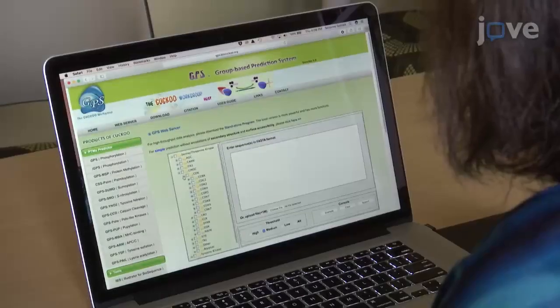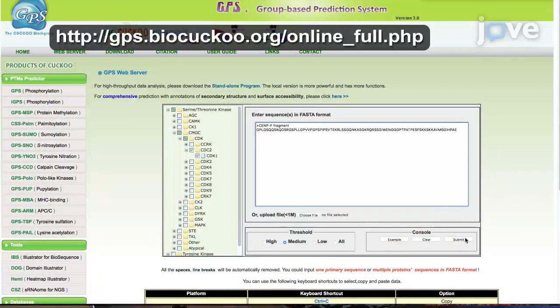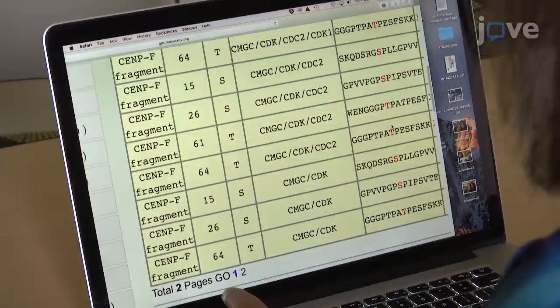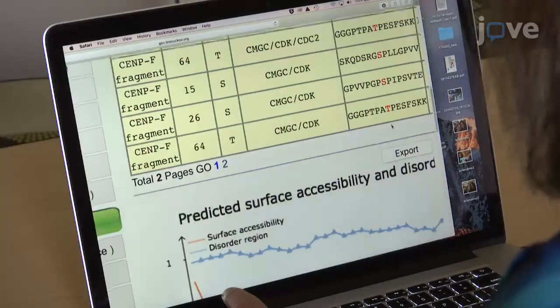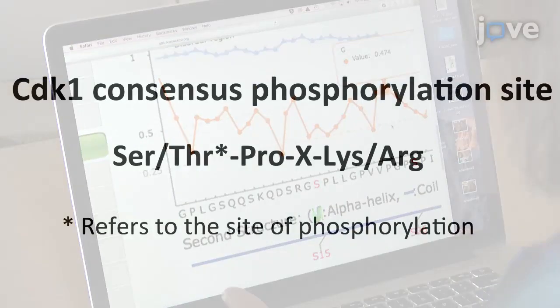Use GPS 3.0 software and visit the web server to predict the CDK1-specific phosphorylation sites in the target protein sequence. Check the phosphorylation sites against the CDK1 consensus sequence.